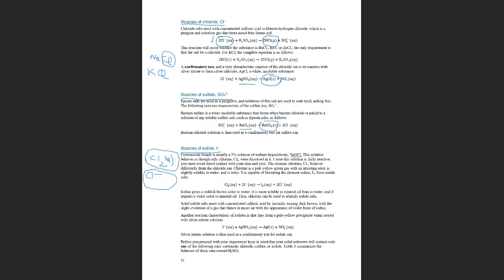So we are going to react the bleach in order to identify iodide. We are trying to identify iodide, and bleach is one reaction that we can perform. So this is the reaction that is described here. The bleach reacts with the iodide to form iodine and chloride.